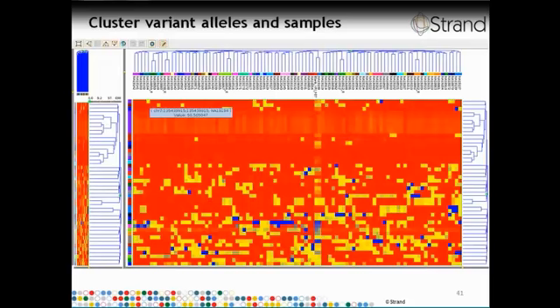One interesting subset to observe is the pink cluster here. There are 3 distinct samples, so the entire trio has formed a cluster. You'll notice that the middle member of that particular cluster has a heterozygous version of the allele. The last member of the cluster does not have the allele at all because there are 0% supporting reads, and the first member has a homozygous version of that allele.